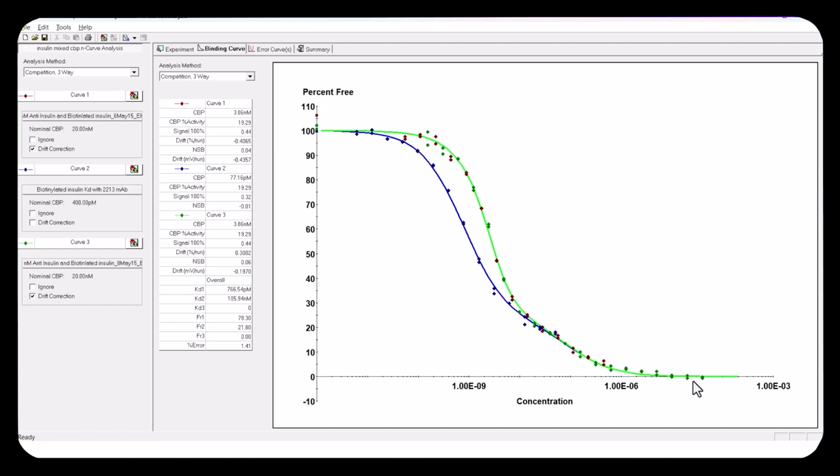Now, here, I would love to go to print, for example, and say there's a mixture of this somehow, but I'm going to want some additional evidence before I do that. There's one piece of additional evidence that I can kind of bend to my theory, and that is that this is an antibody measured against a biotinylated insulin, as I said, and we measured this same antibody against a non-biotinylated insulin, and it looked perfectly normal.